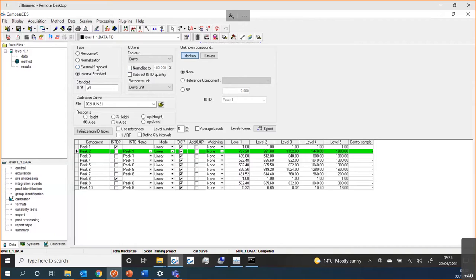We have external standard which, as its name suggests, means you have no internal peaks that you're doing a calculation against. And finally, internal standard. We have a few other calibration types that can be available — they take a little more effort and are not the sort of standard types you would normally see. The one I'm thinking of is standard addition. We certainly have a procedure that allows you to set that up within your method so that each time you run the method, your standard addition is actually calculated.